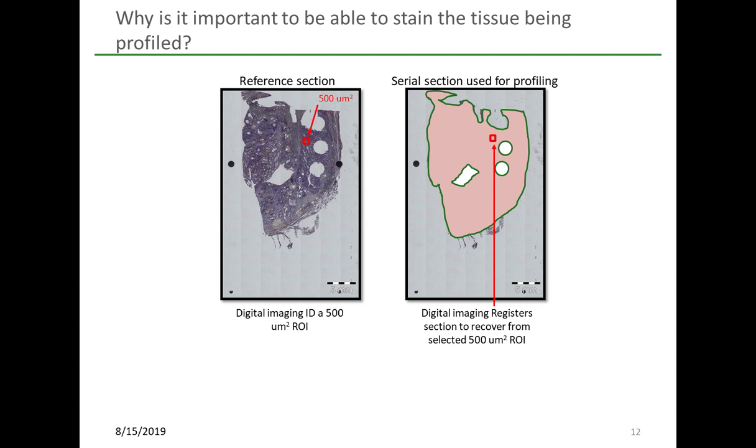So really, it depends on what the tissue is that you're looking at and what question you are asking as to what methodology to look toward. But another consideration is whether you can use directly stained tissue or have to use a reference sample. On the left is directly stained prostate, which means that you can manually go in and pick the area that you want and profile it.